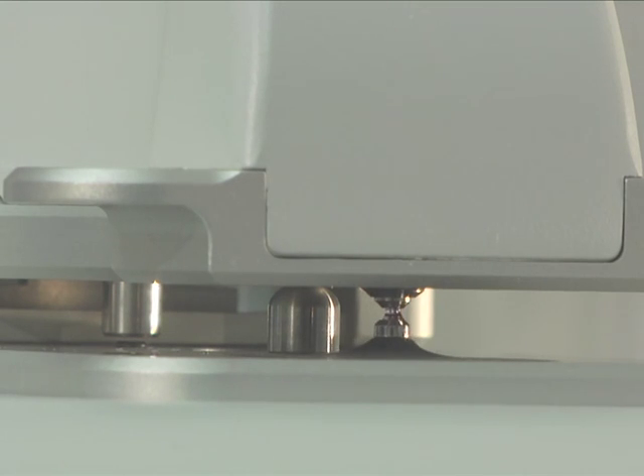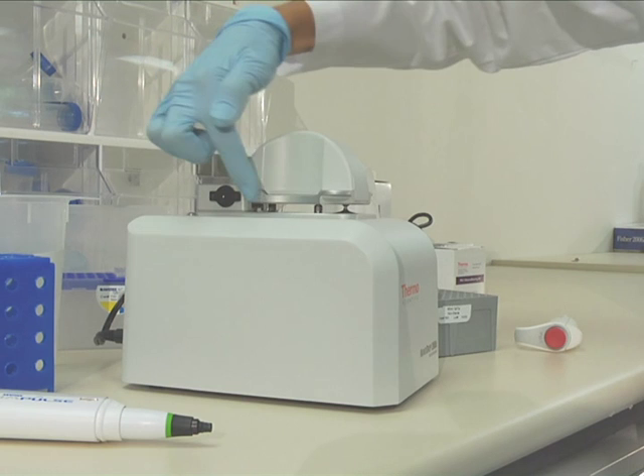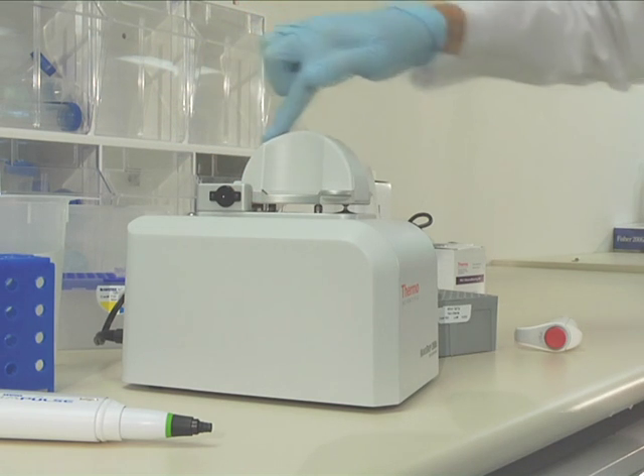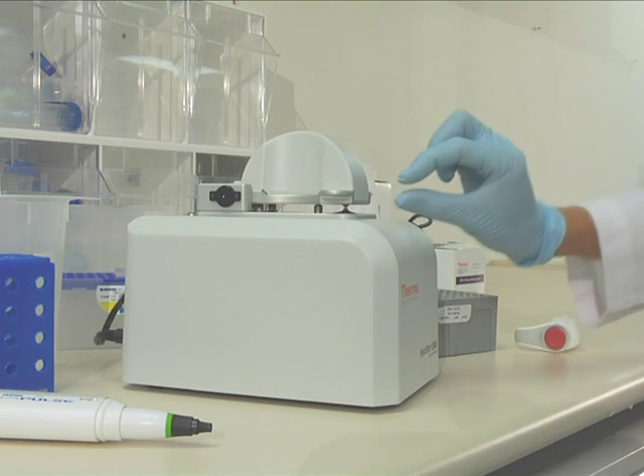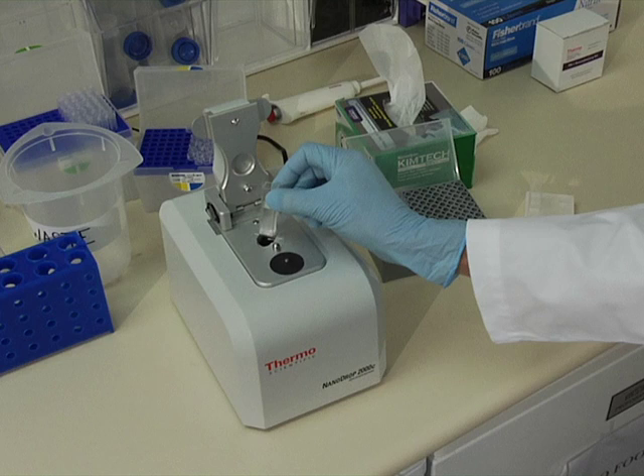This liquid column forms a vertical optical path. A xenon flash lamp provides the light source and a spectrometer utilizing a linear CCD array is used to analyze the light that passes through the sample. Removing traditional containment devices such as cuvettes from the system has several advantages.